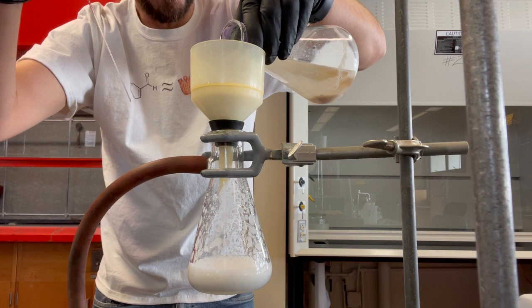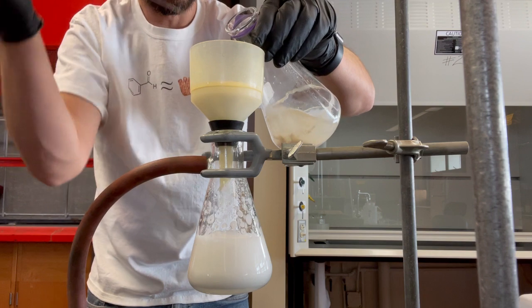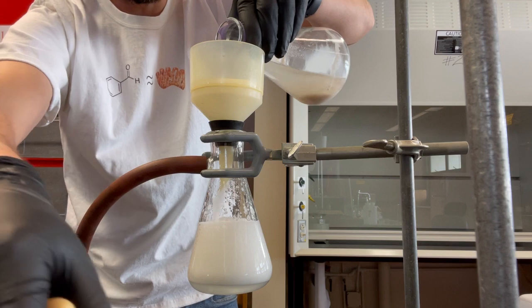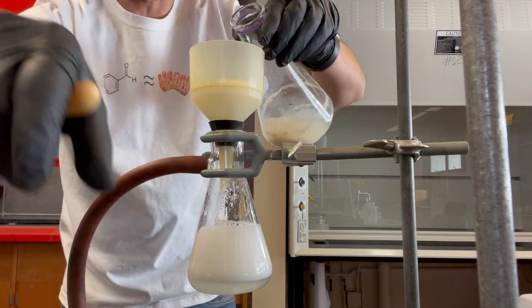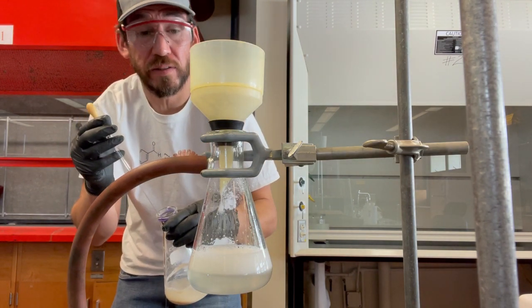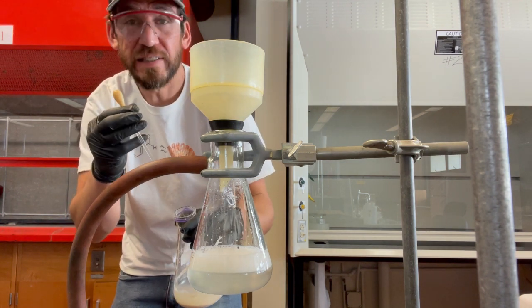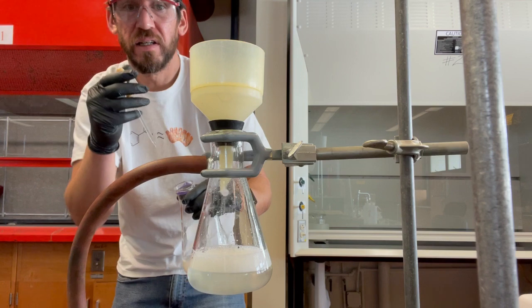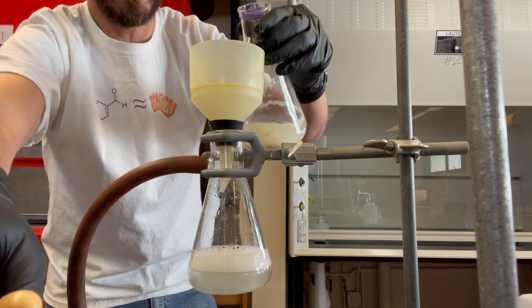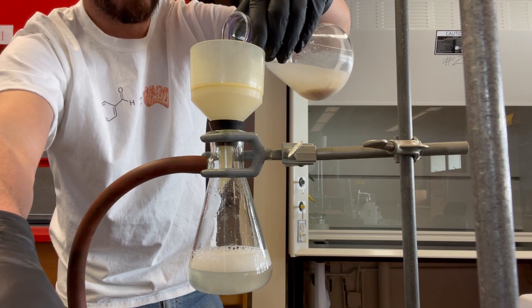So I want to do this fairly fast because after I filter it, I want to get the volume. You can see those bubbles forming. Why is that? Well, it's because there's gas in it, right? CO2. This is a carbonated drink. It's a gross, yeasty, salty, bubbly water, alcohol. It's a nasty mixed drink, something you don't want to drink. But basically, that's the bubbles.